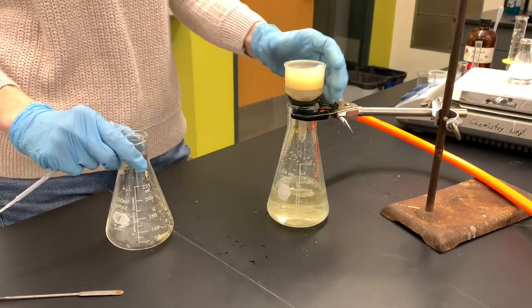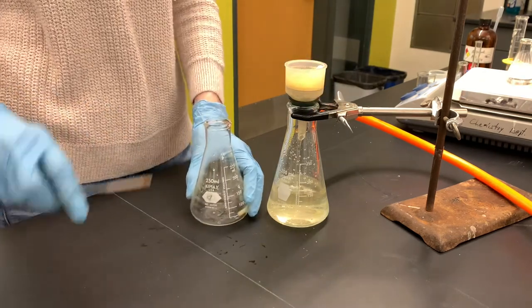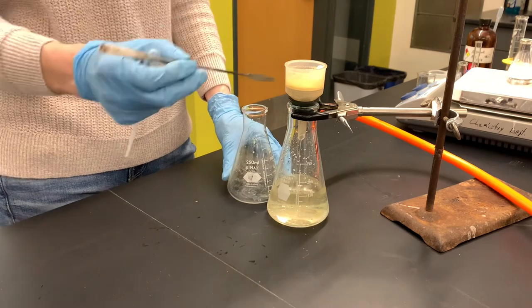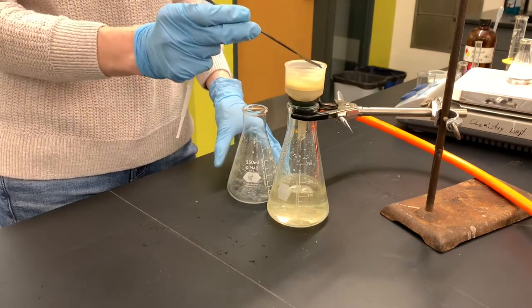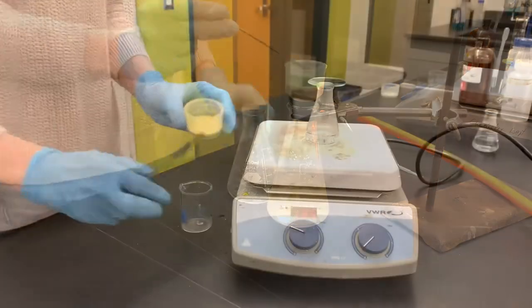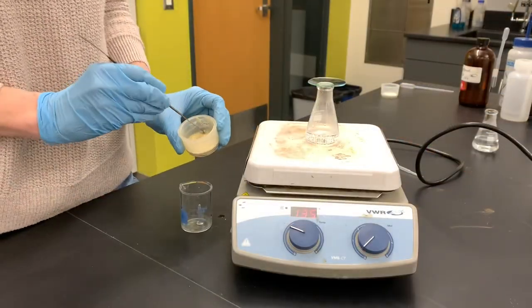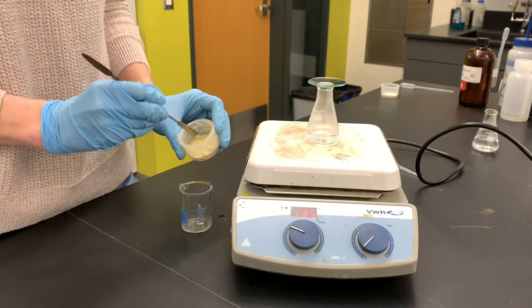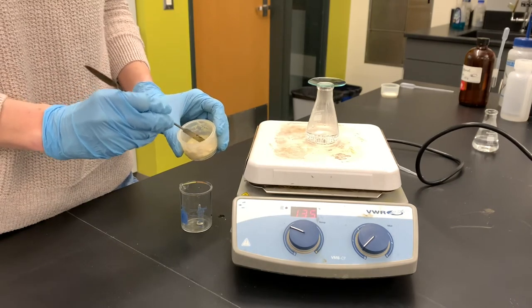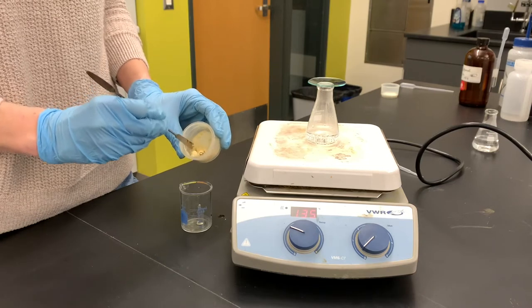Continue filtering. It's probably a really fine solid because the vacuum is having a pretty hard time sucking the liquid out. Once it's done, then we will recrystallize it. So this is the crude product, the yellow, kind of powdery, and we're gonna recrystallize it. Not taking a mass or anything on the crude product, we're just gonna go straight to recrystallization.